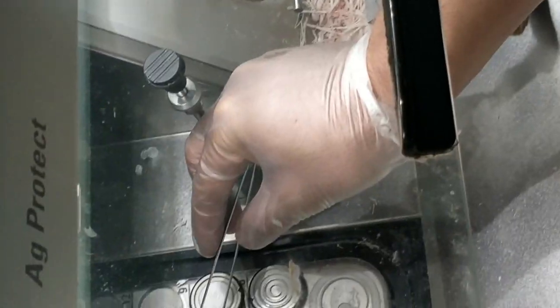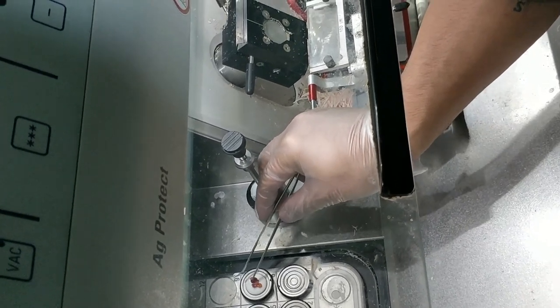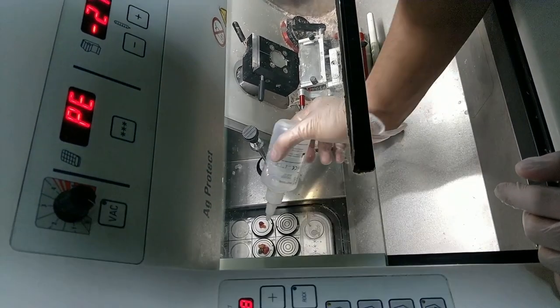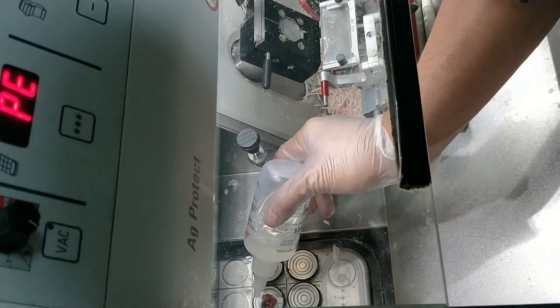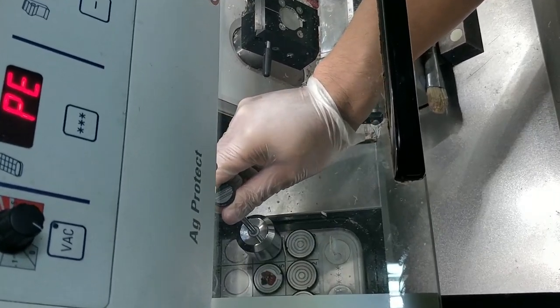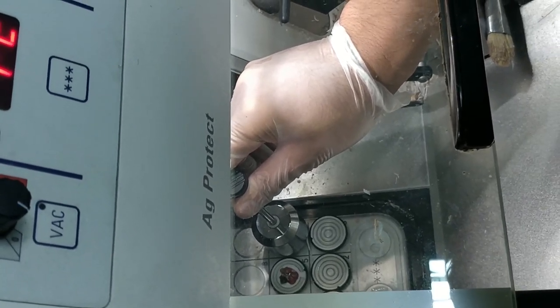So then after placing, you see that hammer-like thing, that shaker-like thing. That's our heat transfer apparatus, no? Heat transfer tool. It can transfer the residual heat from your specimen into the tool, no? Since it's cold, it facilitates the freezing. Apart from that, its surface is flat so the interface between the blade and our specimen is even, no? When it cools a little.